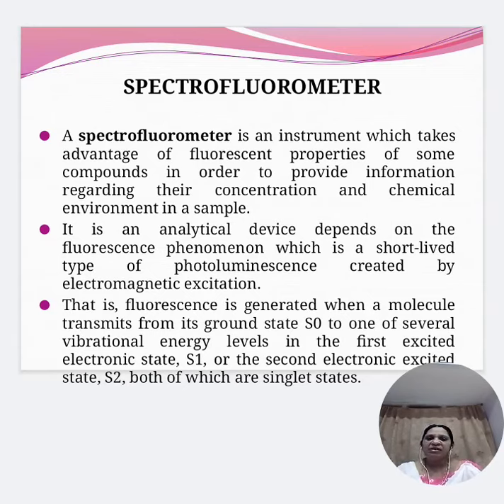Spectrofluorometer. Spectrofluorometer is an instrument which takes advantage of the fluorescence properties of some compounds in order to provide information regarding their concentration and chemical environment in a sample. It is an analytical device which depends on fluorescence phenomena, which is a short-lived type of photoluminescence created by electromagnetic excitation.